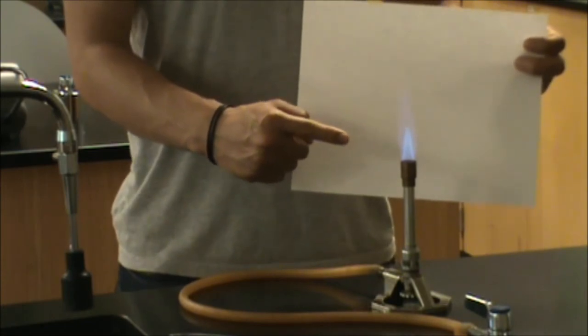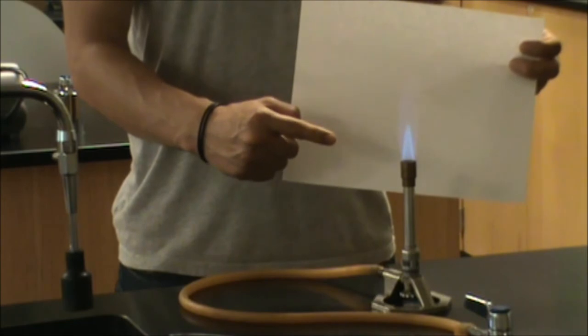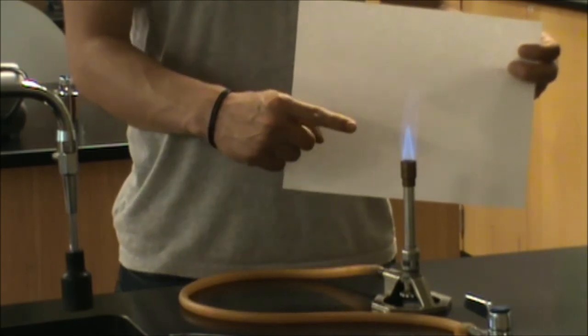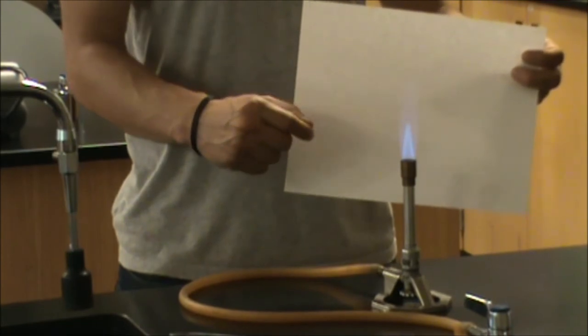So depending on what you're using the Bunsen burner for, you might want to use the different parts of the flame. For example, if you're trying to ignite a strip of magnesium, you want a very hot, intense flame. You'd want to hold it right in the tip of the bright blue part of the flame, that's the hottest part.